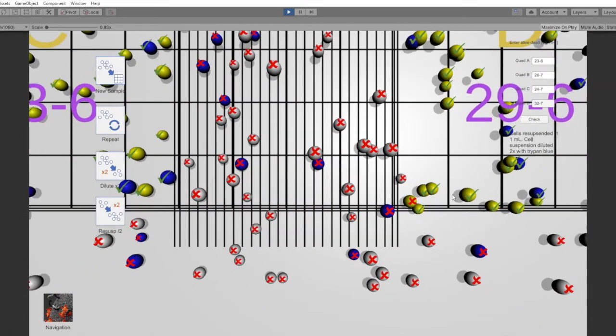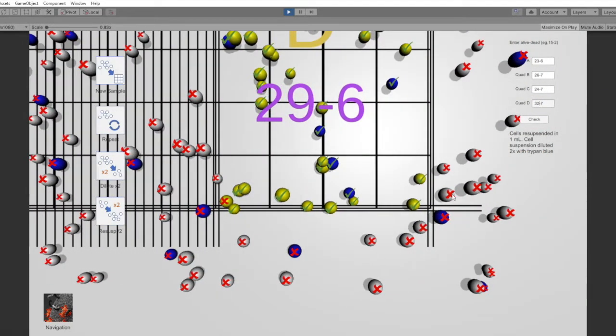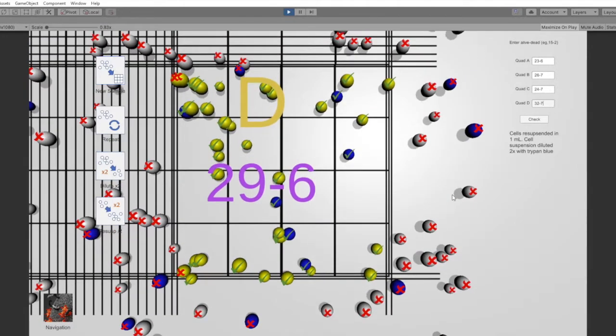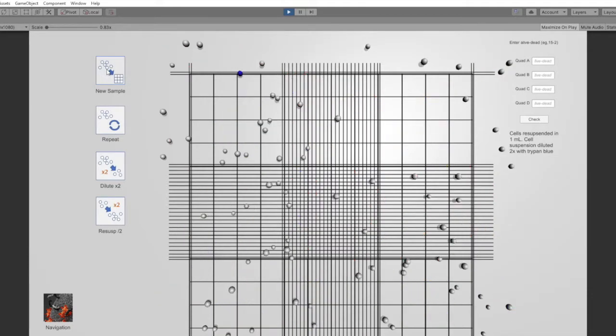And of course the key thing is if you start to pan and get that quadrant right in the middle of the field of view, then suddenly you can see that one in the bottom left-hand corner is just touching the left line. Same for the ones in the top.